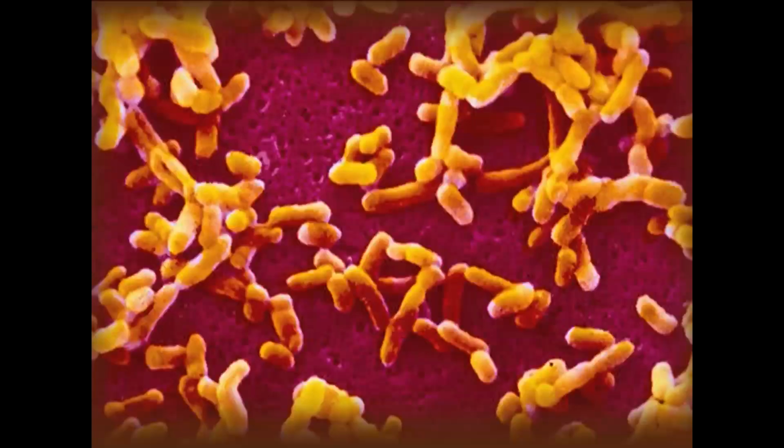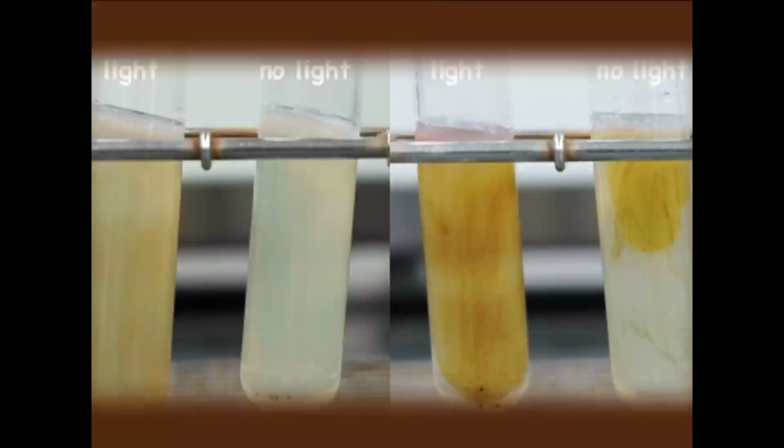Ma'am, I have a question. How do we cultivate anaerobic bacteria? The anaerobic bacteria can be cultivated in the lab in two ways. If we want to grow them in solid medium, then generally we go for agar dips, in which the molten medium containing agar is placed in culture tubes and solidified in an upright position.